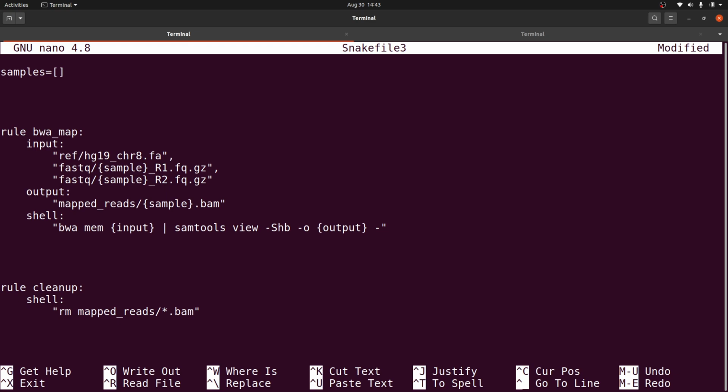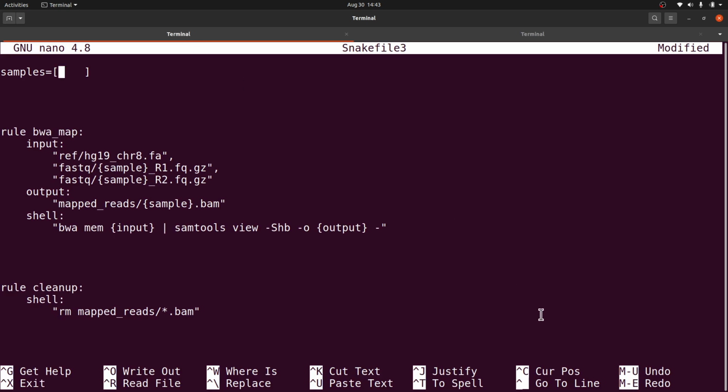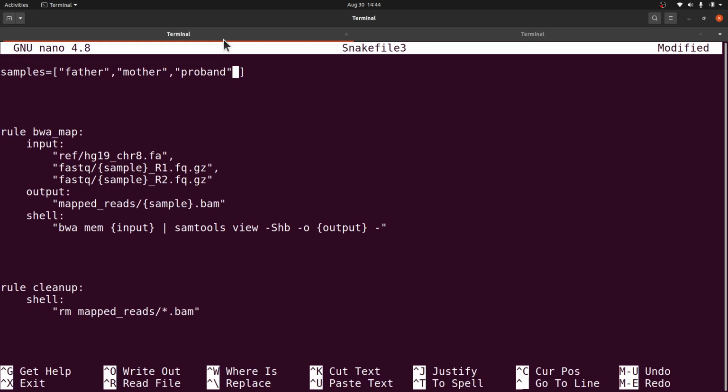All right. So in it, we will specify the samples. In this case, we have father, mother, proband. I'll specify father first, in quotes. So I'll say "father", comma, double quotes again, "mother", comma, and then "proband". This is the only thing I need, right? Though we have R1, R2 for each sample, it doesn't matter. We are going to factor all that in whatever we are going to do here. We already have the base command itself, so it doesn't even matter much. We will just do them here. All right. So that's what we are going to do.